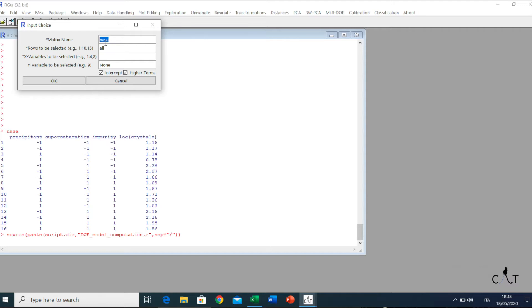We click on this and here we have the new dialog box. We already have NASA as the matrix name. Here we have to select the rows, and all rows will be considered. The variables to be selected are columns 1, 2, 3. We can see that not every entry has a star code — in particular, our response does not have it. So it means we can go on even if the matrix is given without the response; in that case, only the diagnostics of the model will be computed. This is very useful because before performing the experiments, we can check whether the matrix is compatible with the postulated model.